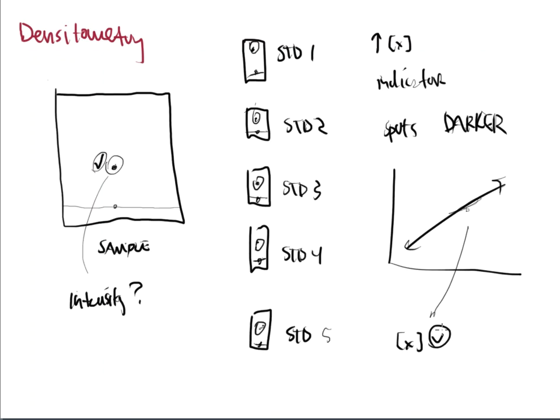The problem here is that this is not heavily done because chromatography actually takes care of this aspect a little bit better. So if I do have to do quantitative measurements, I would prefer just to go ahead and run a full-blown ion chromatograph or a high-performance liquid chromatograph or a gas chromatograph. I would just get one of those instead. TLC is more for preparatory work. And that's why we don't really see a lot of 2D stuff. And that's why we don't really see a lot of the densiometry that can come along with the 2D TLC plates. There's just better scenarios and better pieces of equipment to actually get this thing taken care of. All right? So that's one of the few topics that we have to talk about last.